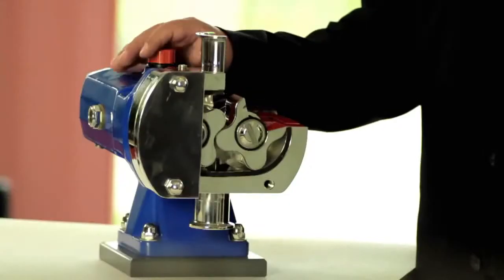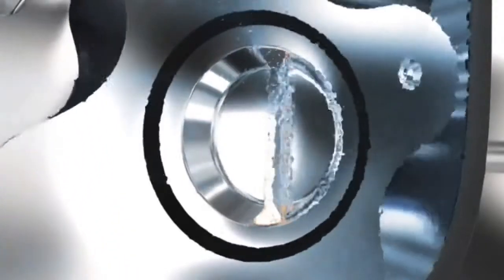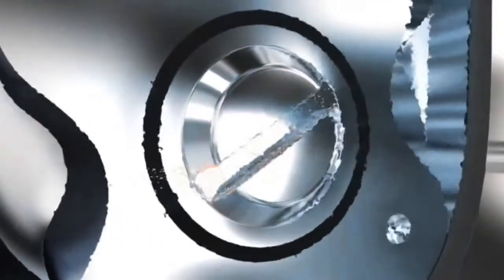Another example of contamination safe design is our SX Rotary Lobe Pump. The replacement of traditional O-ring sealing with a profile gasket system provides complete alignment accuracy and eliminates crevices. The raised slot design puts the slot in line with a high-velocity slip pump to ensure thorough cleaning during the cleaning cycle.